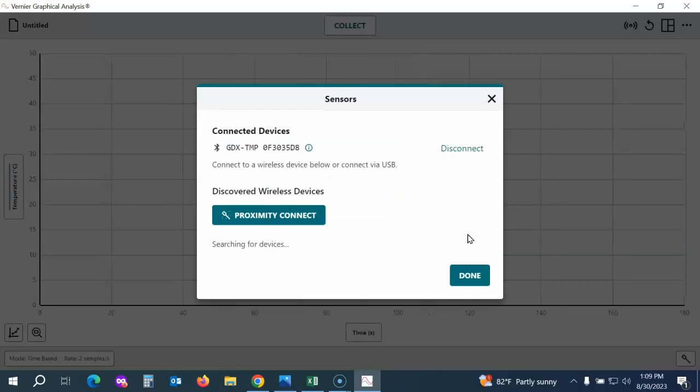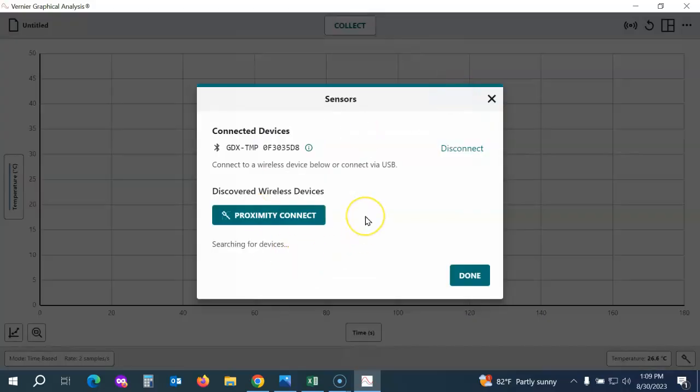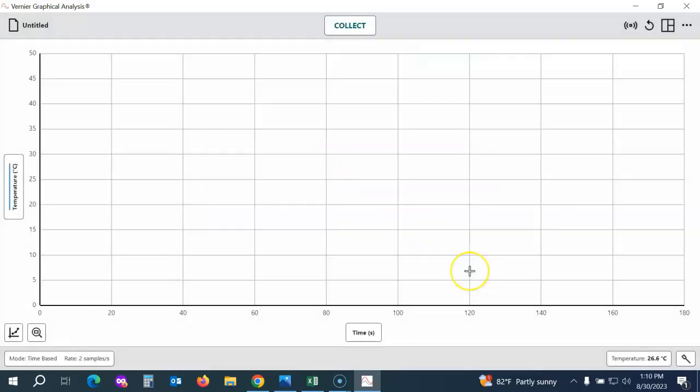As soon as a student group connects up to the device, it will flash green, and that device will no longer be available to other student groups to connect to. You can see I'm connected to the temperature probe. I can click on the little eye button to check the battery level of my probe. I can also connect to another probe — for example, I could collect temperature data at the same time as carbon dioxide data. Once I'm connected, I'll click Done.